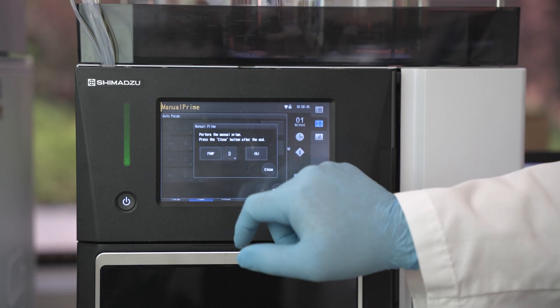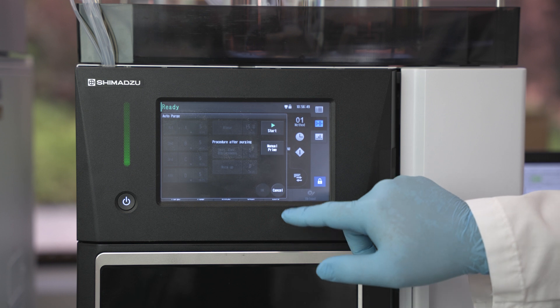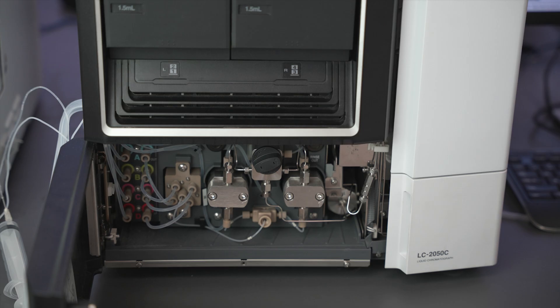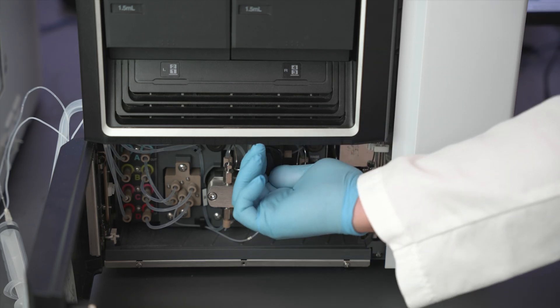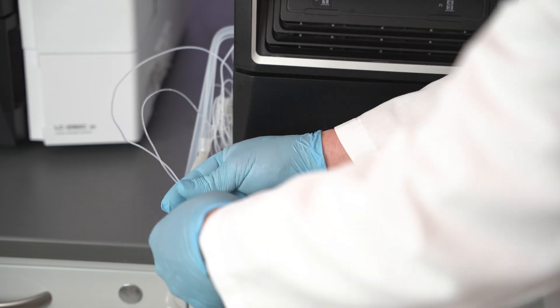Press on the pump button. The pump will stop and the button will change from blue to black. Close the drain valve in the pump section. Remove the syringe from the waste line and replace the waste line into the waste container.